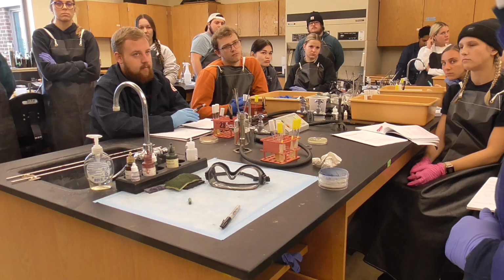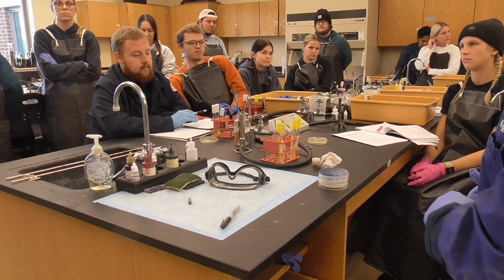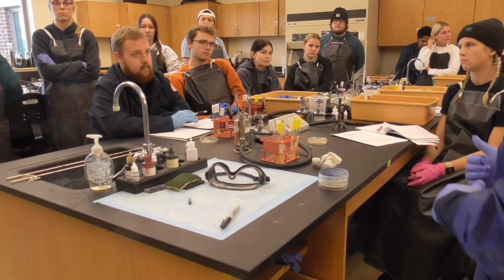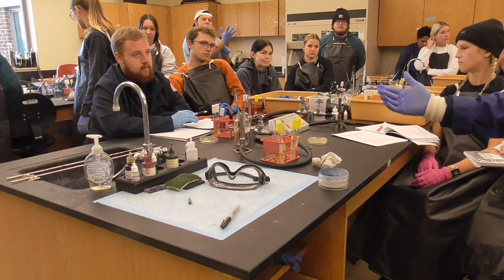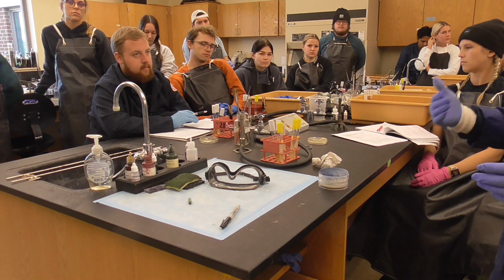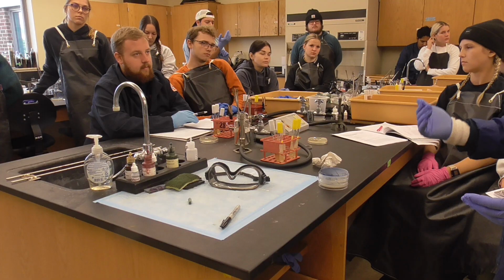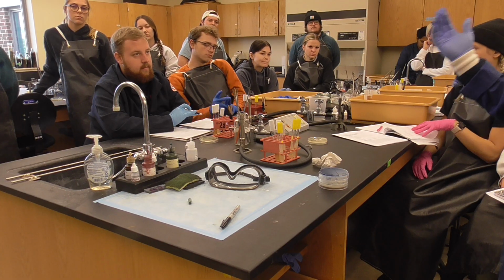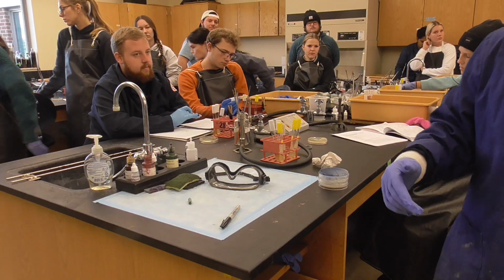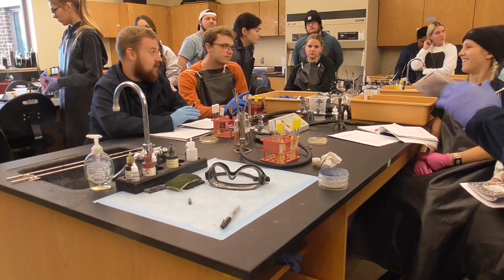So you have one representative do E. coli and Citrobacter. Then we'll see on Thursday what it looks like. Maybe there's no difference in E. coli, maybe there is. Because we know Bacillus subtilis is a bacterium with very good enzymatic activity, but we don't know what Citrobacter looks like. So one bench has one representative do Citrobacter with E. coli. Others do E. coli and Bacillus subtilis. Okay.